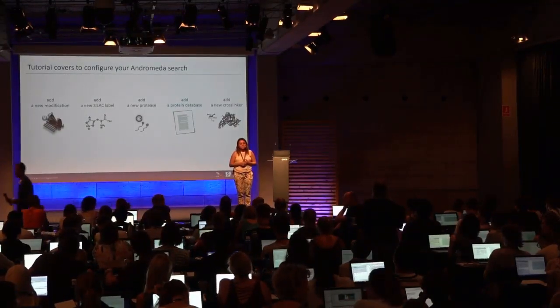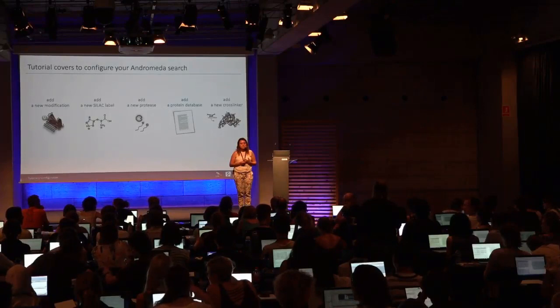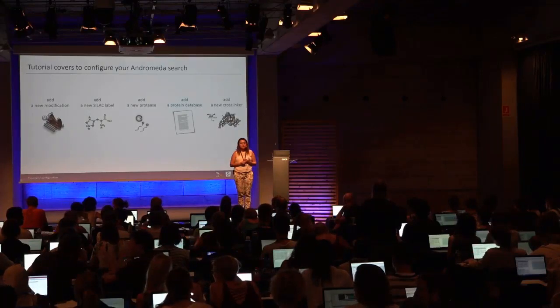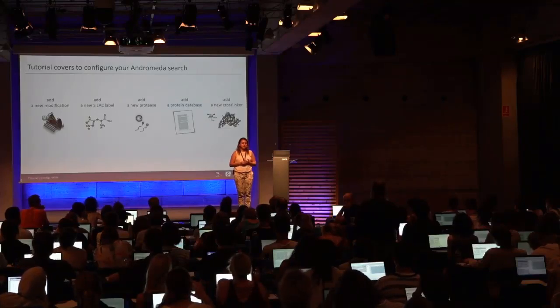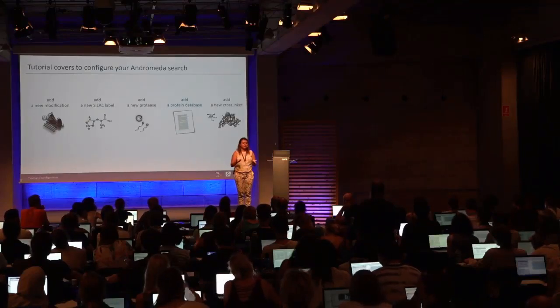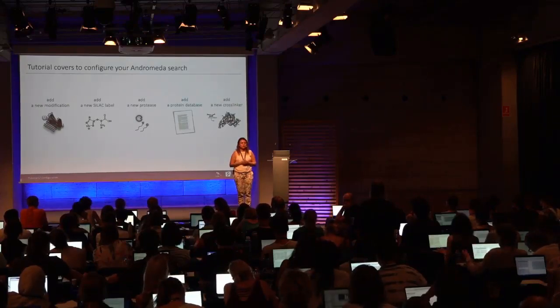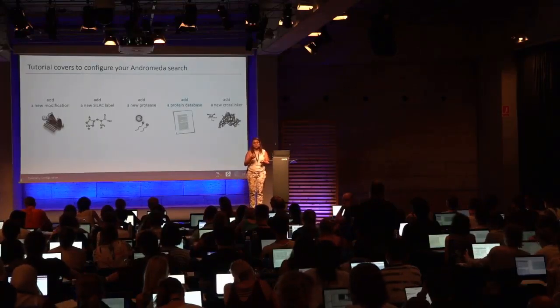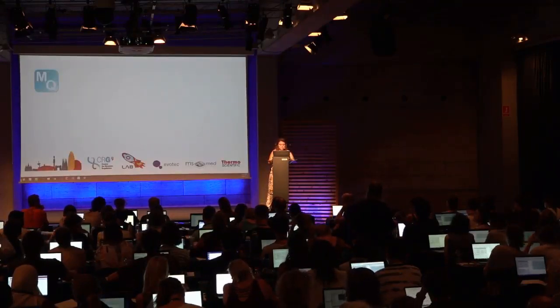Hi, just one more question. What is the authenticity for adding a new modification from Unimod? Is it all authenticated enough that I can simply trust it, or, for example, does one have to be cautious in adding a new one? My advice: first try to search if your modification already exists in the table, like Control F. If you don't find anything, you could go and add the modification. The description will therefore be important for you to find what kind of modification already exists. Okay, thanks.